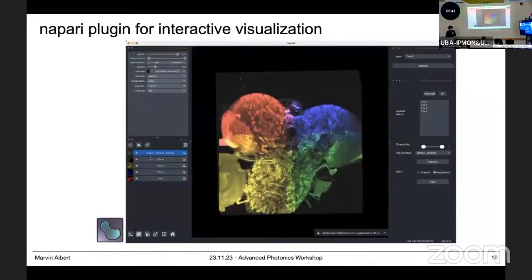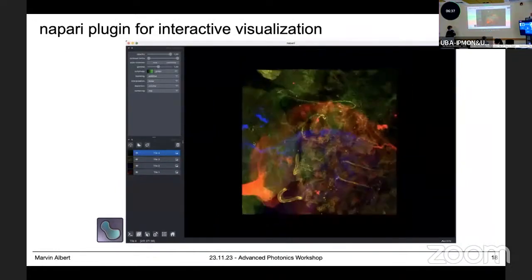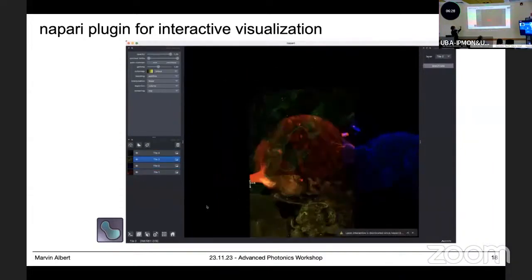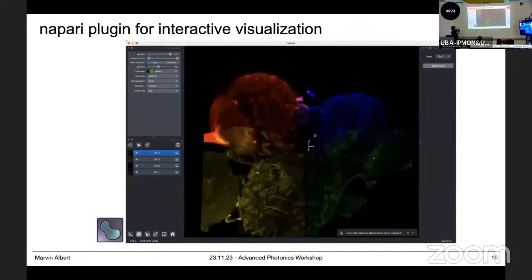And this is just another, I'm trying to be short, I'm almost done. This is just another video showing the same, a bit more interactive in napari, where you load a lot of TIFF files into your viewer and at the beginning arrange them in a way that you're saying this could be more or less the way that I want to stitch my data.